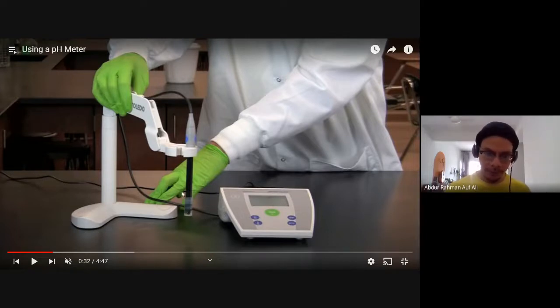So this is why at the tip of the electrode here we have a cap, and in that cap there is potassium chloride solution, salt water. So it is very sensitive, we cannot let it get scratched, cannot let it dry. If it gets scratched and dry, its quality will deteriorate, and our measurement will not be accurate and precise. Alright.